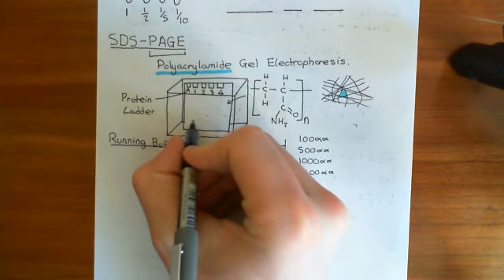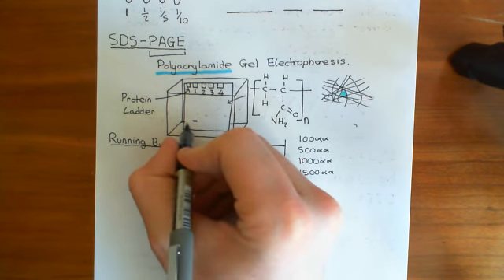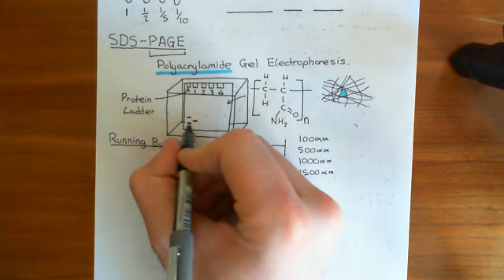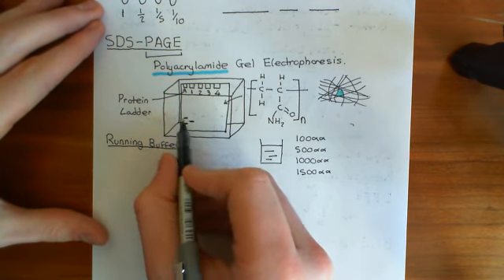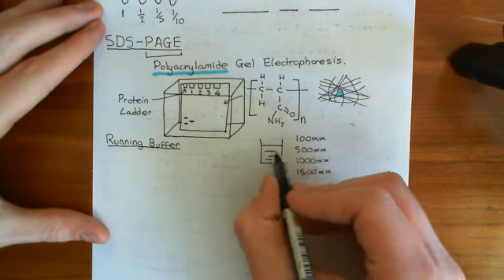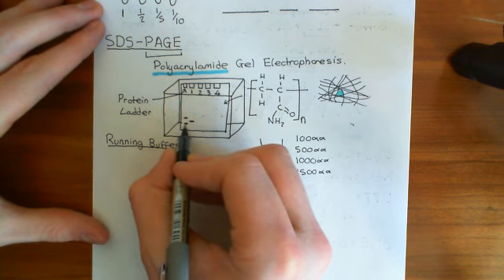And that will give you some idea of what it actually means for a protein to have got a certain distance. So for instance, if you find a protein getting this far in well 1, then what you'll be able to do is say, here's my protein ladder. It's between my first one and my second one. So let's say these are the first 2 lines that I see on my protein ladder. Now I know my smallest protein in my protein ladder was 100 amino acids, so this one is the 100 amino acid one.